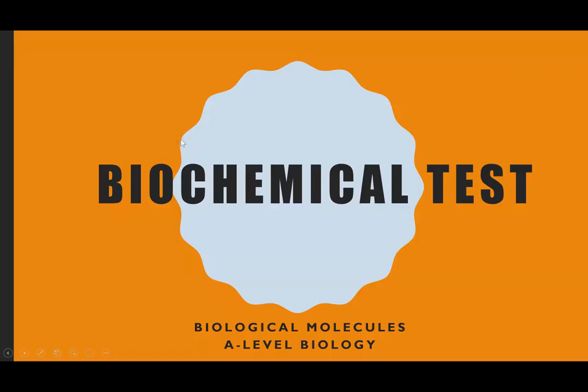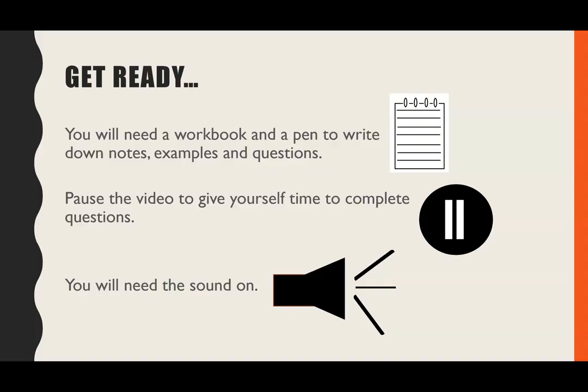Today we're going to be going through the biochemical tests that you need to know for the biological molecules unit in A-Level Biology. You will probably find it helpful to have some paper nearby so you can make a note of the tests' positive results, and there's one question slotted in this time as well, for which I'll give you a reminder just to pause the video at that point.